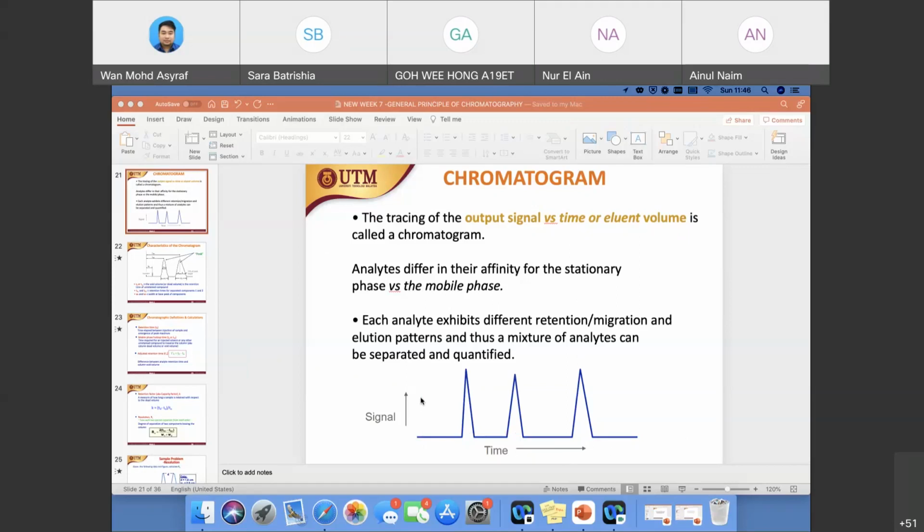All right. So based on this chromatogram, just a simple chromatogram, we have A, B, C from the left. The time of A is much lower as compared to C, which has a much higher time. Which one elutes first? A, B, or C? Any guess? Sachwin? Or anyone want to try to answer?